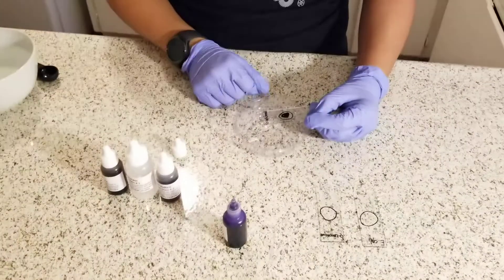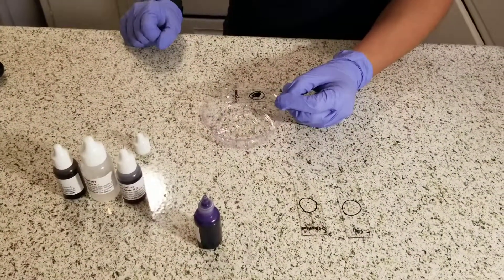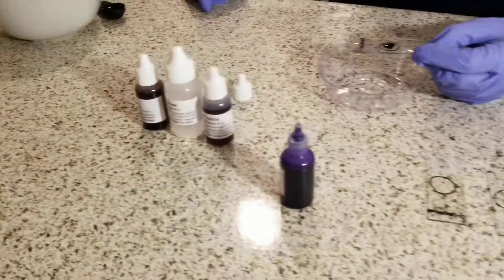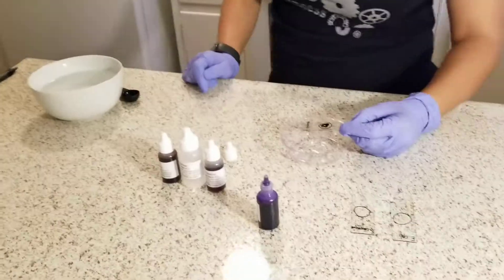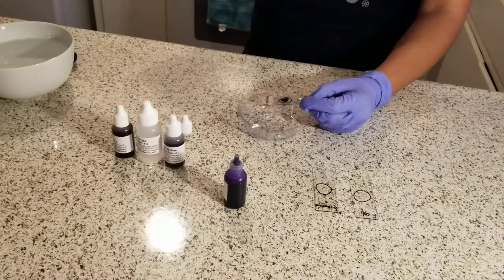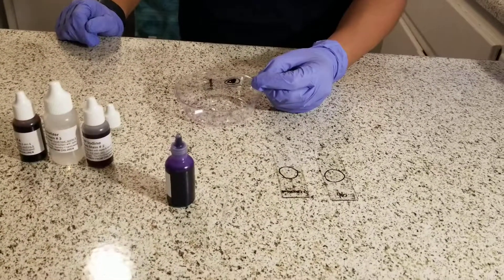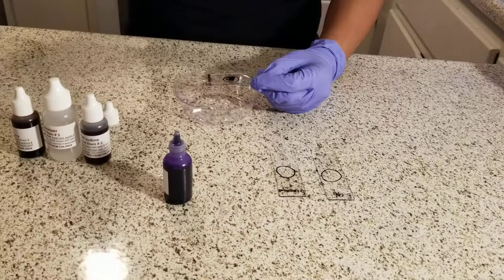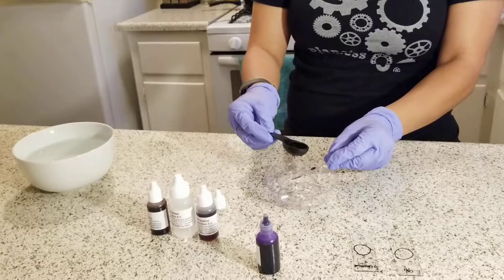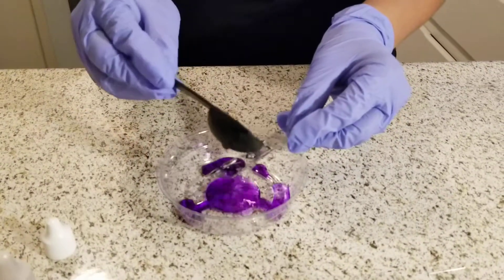The crystal violet stain is associated with peptidoglycan. All bacteria have peptidoglycan in their cell walls, so that's why it will stain the bacteria purple. After the 60 seconds, I will go ahead and rinse it with tap water until the liquid runs clear.